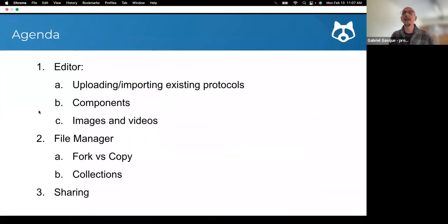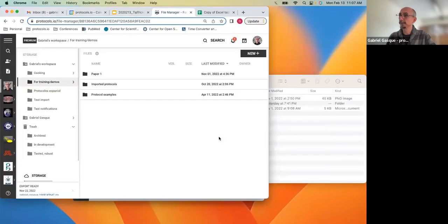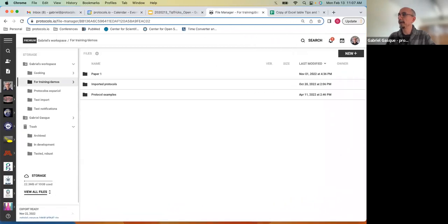So now let's begin, and let's start with the editor. So as I promised, this will be a live presentation. So here we have my account in protocols.io.